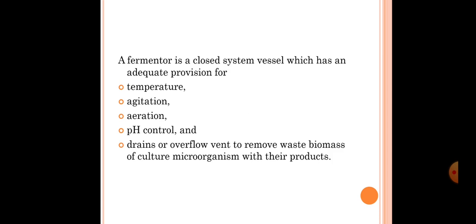Therefore, a fermenter is basically a closed system vessel which has an adequate provision for temperature control, agitation, aeration, pH control, and drain or outflow vent to remove waste biomass of culture microorganisms with their products.